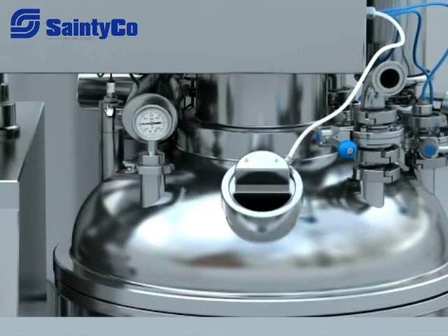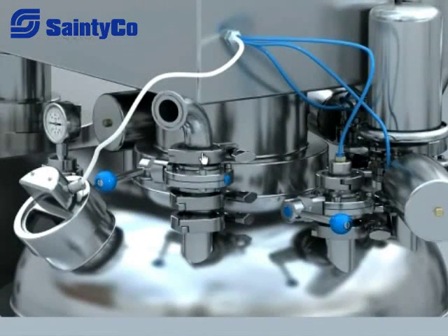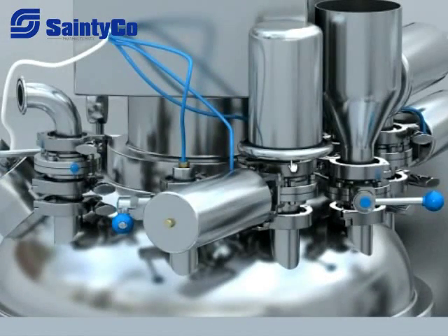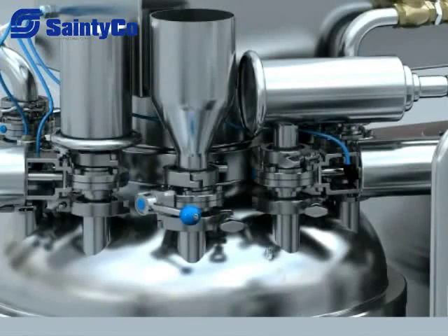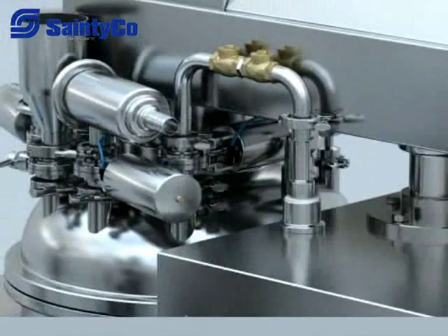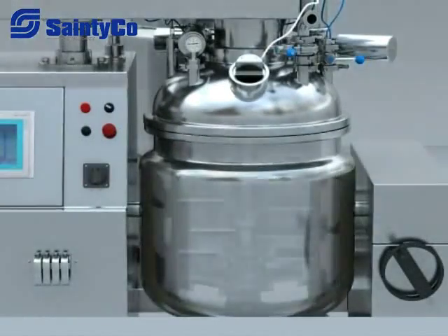On the upper ceiling head there are a vacuum sensor, diagram vacuum meter, sight glass, CIP purge valve, pressure valve, respiration device, accessories feeding valve, liquid feeding valve, and pneumatic valve for vacuum.